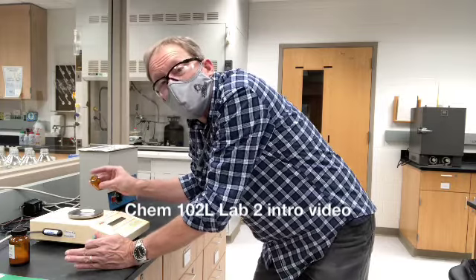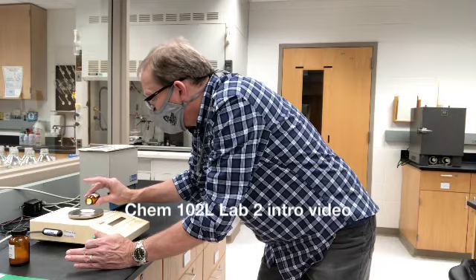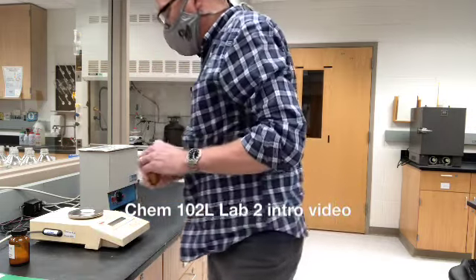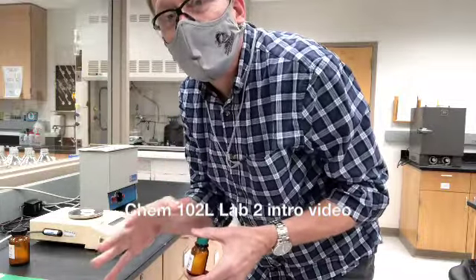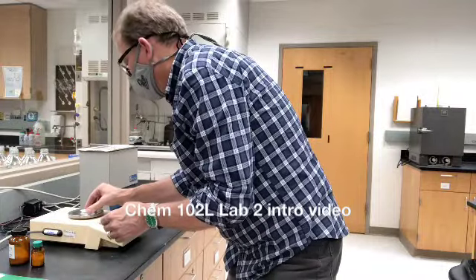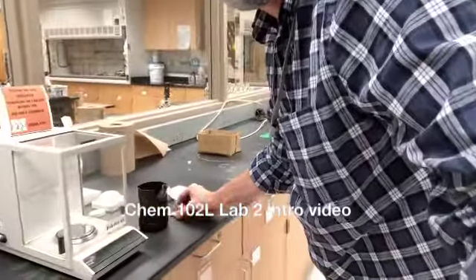I have to decide, do I want a little bit more? I might go over. Another tap. And now I'm a little bit over. I'm at 0.84. And 0.84 is close enough to 0.8 that we're just going to use it. So that I don't need to measure so accurately. I want to do that accurately over my analytical balance. I want more precision in the measurement.